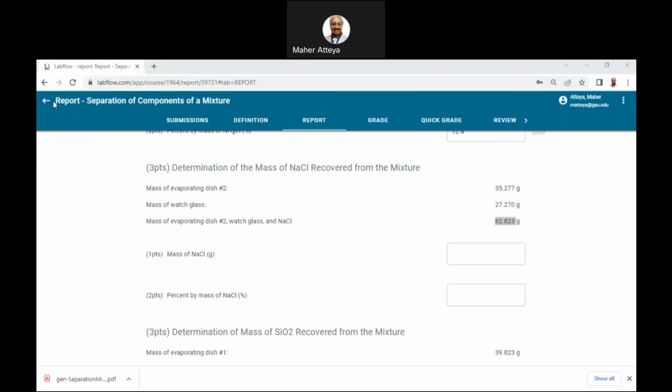Copy. Paste. And then copy this one here and paste. Therefore, this is minus.